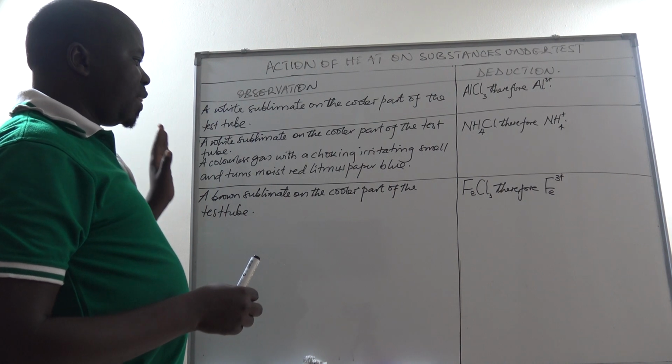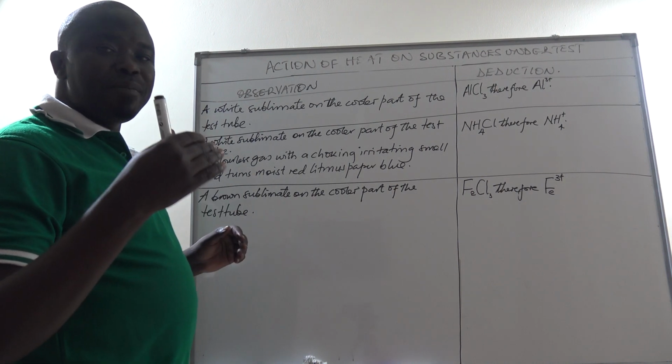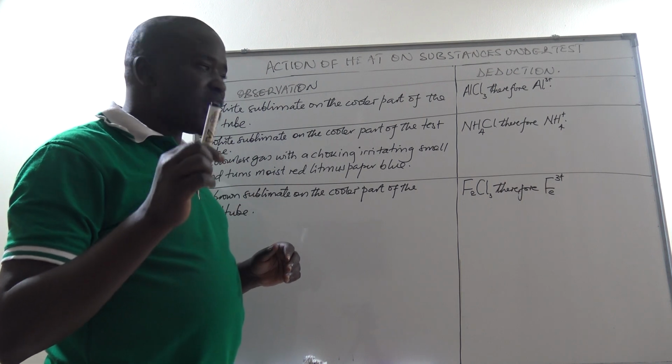Now, this is with the sublimates, and we are remaining with the residues, which we are going to see in our next session.